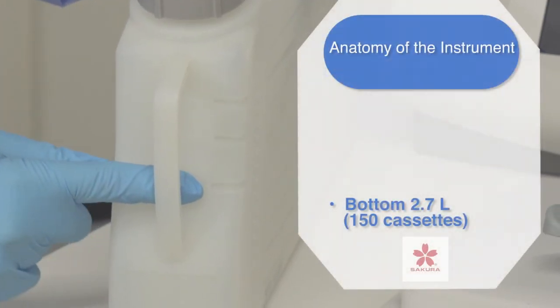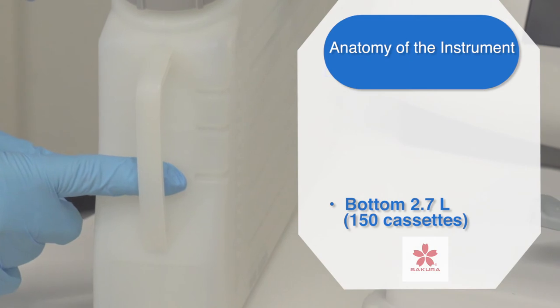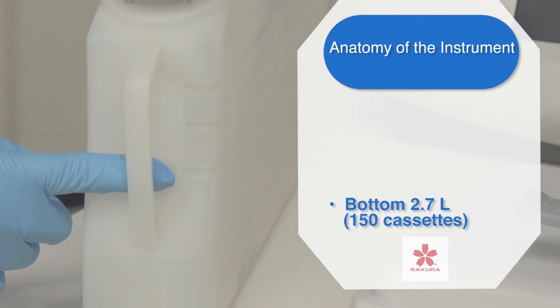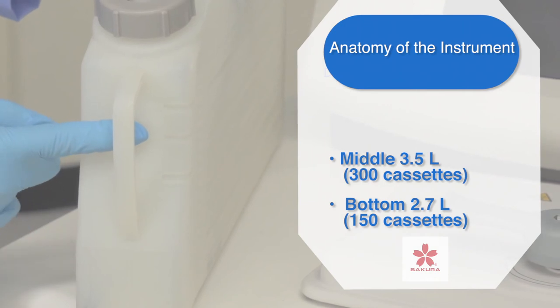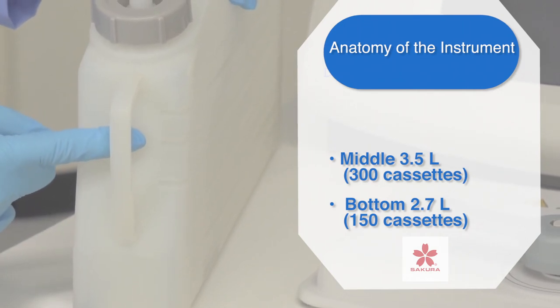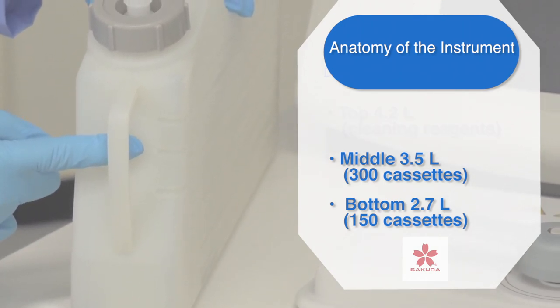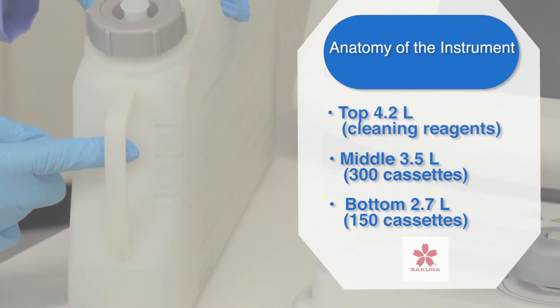The bottom marking is 2.7 liters and is used for processing 150 cassettes or one basket. The next one up is 3.5 liters for 300 cassettes or two baskets of tissue. The top marking should only be used for your cleaning reagents, stations 16 and 17.